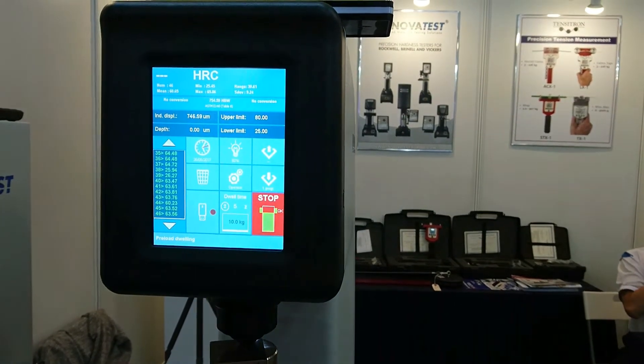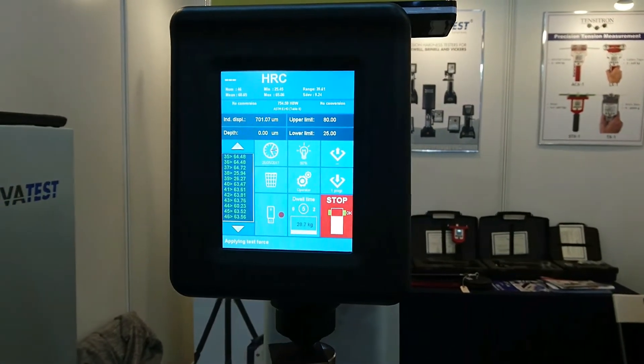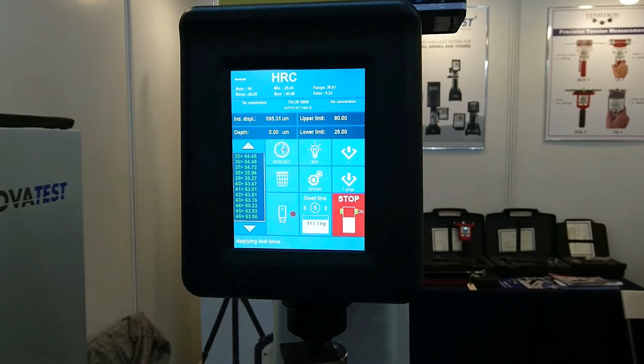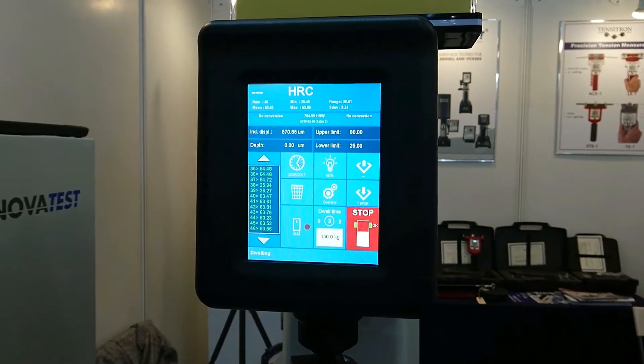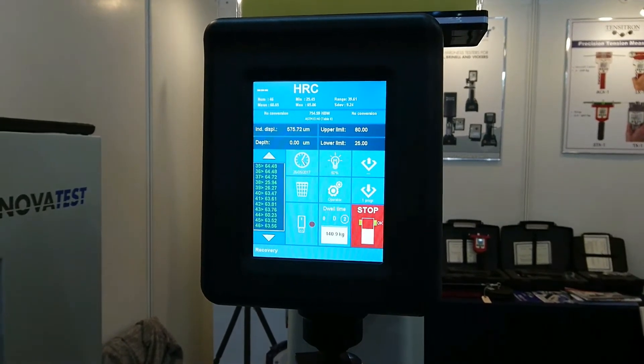Let go of the spindle and the testing will take place automatically. You will be able to see the screen which indicates that the dwelling process is ongoing, and after testing is done, the hardness value is shown immediately on the screen.